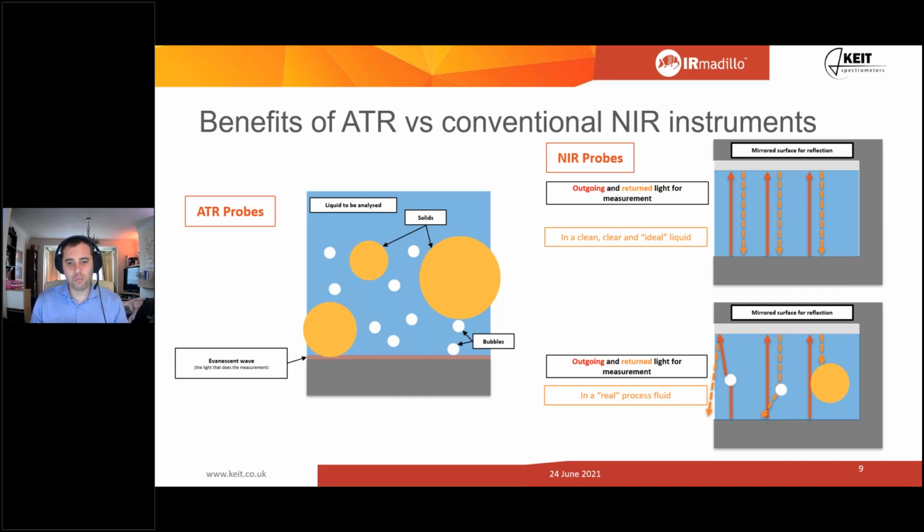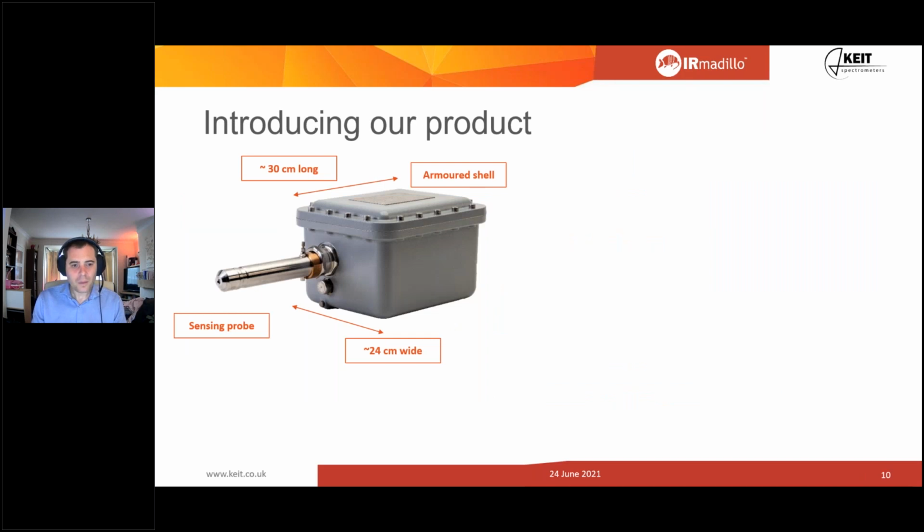So one phrase I hear quite a lot is, oh, we tried an IR, it doesn't work. I wouldn't necessarily disagree with that. But what I'm talking about today is FTIR, mid-infrared, not NIR. So I appreciate I'm laboring that point, but I'm trying to make sure it gets driven home because they are fundamentally very, very different.